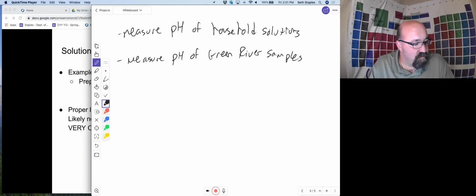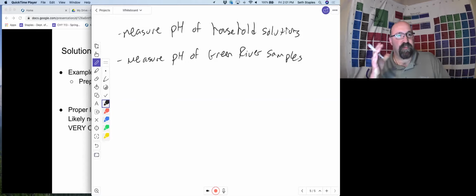When you are measuring the conductivity and the pH, it's similar to when you measure turbidity. You're not going to have a point where the probe just settles in right directly on a measurement and stays steady. You're going to have to watch it and recognize, okay, it's pretty much staying right around this value now. And so my conductivity is this. So this is a lot.